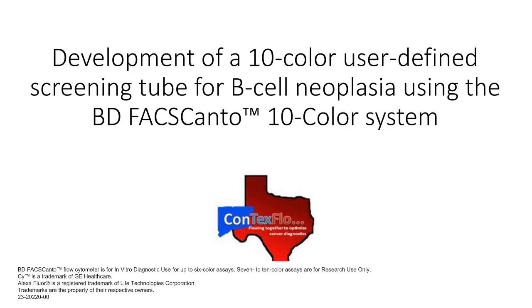Or if we have low cellularity to the sample, so that we wouldn't be able to do it again if it came back with high background staining for kappa and lambda. Otherwise, we don't do the pre-incubation, and if we do have difficulty with background staining, then we will repeat the tube by incubating at 37 degrees. And do you add fetal calf serum, any kind of blocker, or just in the blood or marrow? No. Okay.